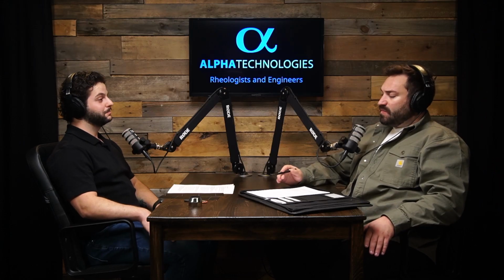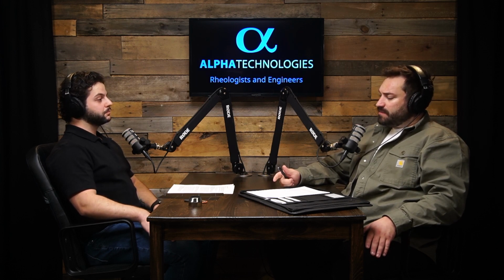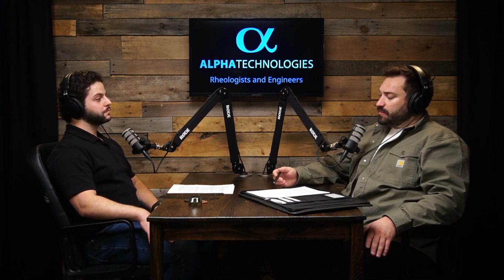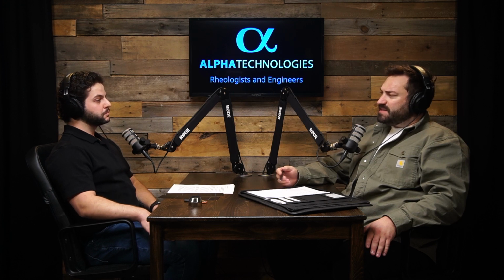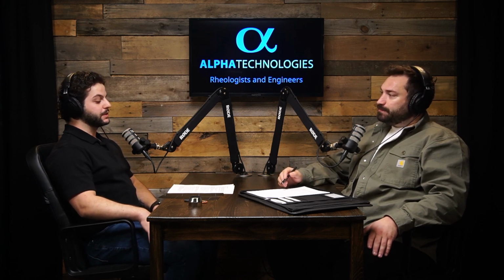Interesting. So you mentioned you identified these key factors. They were what? Temperature, pressure, and out time? That is correct. So could you walk us through each of those and what do those do? Especially the out time. I'm not 100% familiar with that one. Definitely. Excellent question again. So basically we like to investigate the three pillars: temperature, out time, and then pressure.